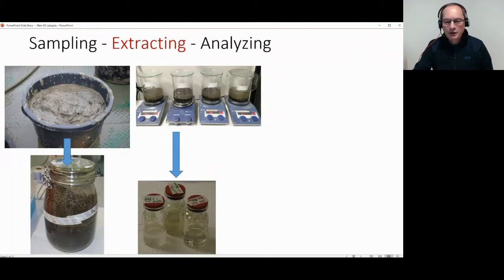I'll not go into too much detail about it, just a little bit about how we do. But this step to get from this sediment to the concentrate is really the big work. For a sediment like this, it takes 3 months to prep it without damaging the plastics. So this is really the big thing.